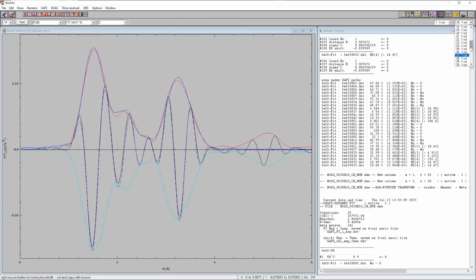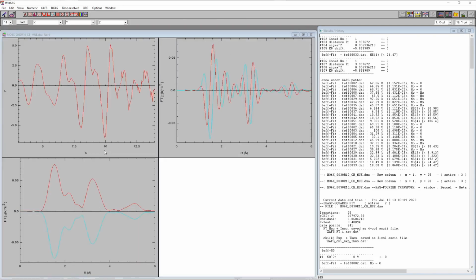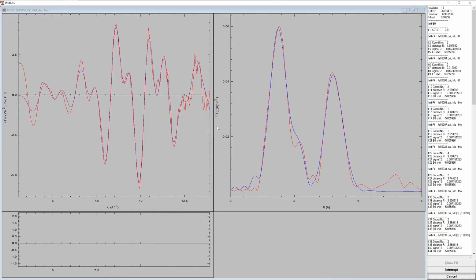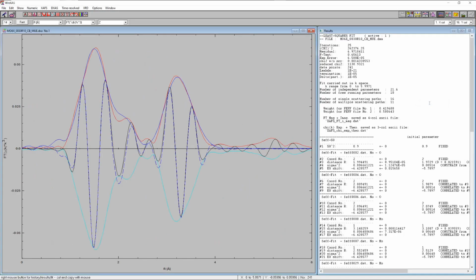We can do the same, test the same now, let's say for column 16. Let's load column 16 and apply the macro. And so this is the refinement, and those are the results. And here we are at about 42% molybdenum dioxide and 58% molybdenum trioxide, according to the XANES fit results. So again, those are the concentrations taken from the XANES fit results.